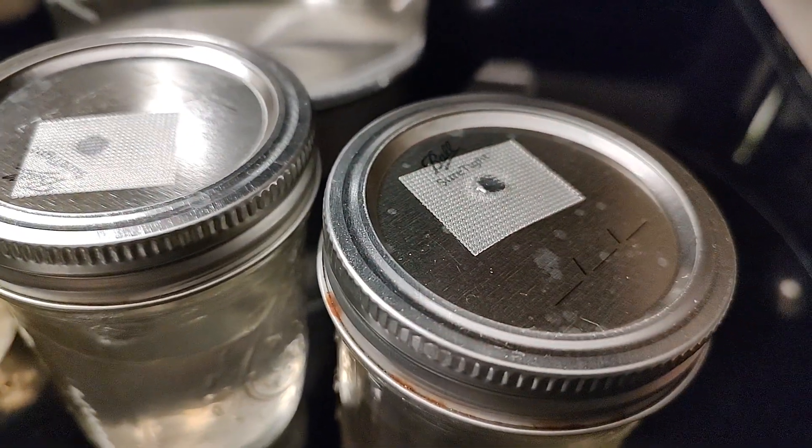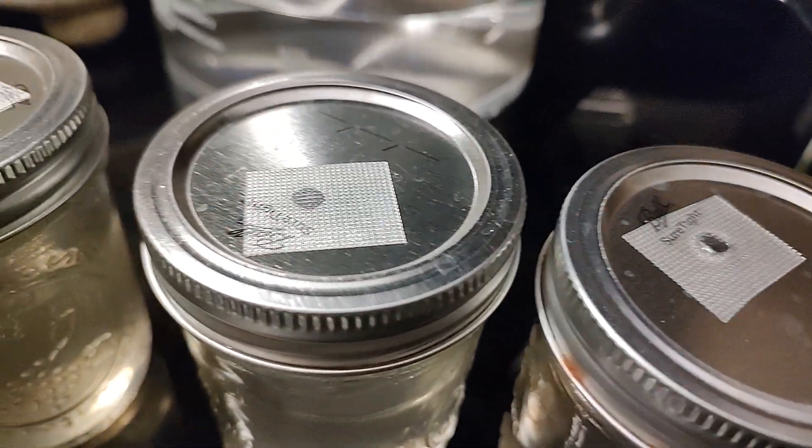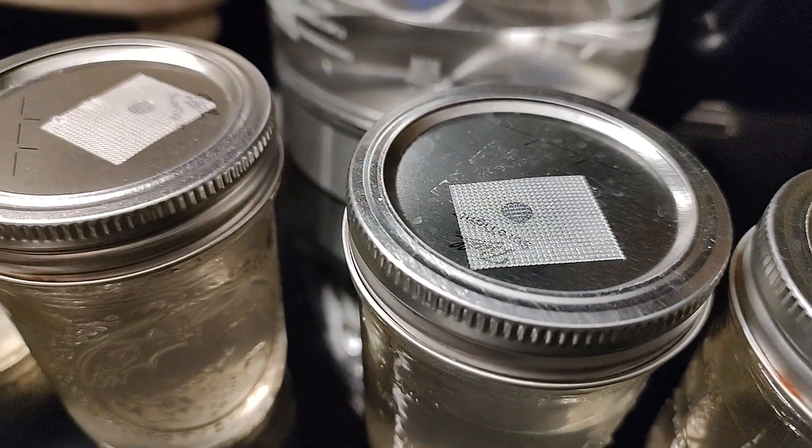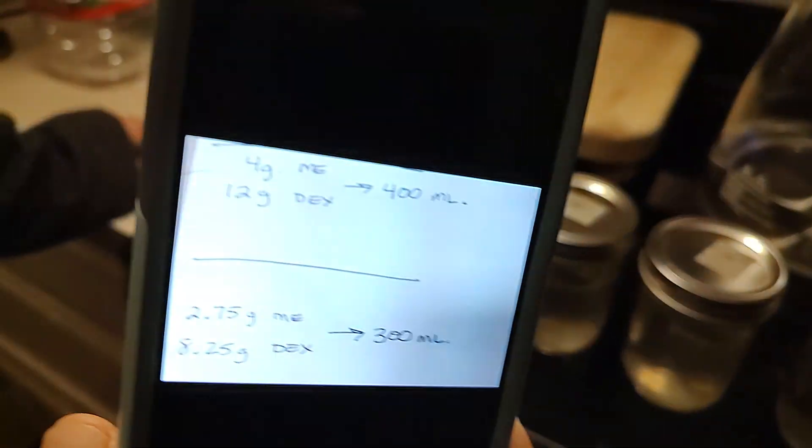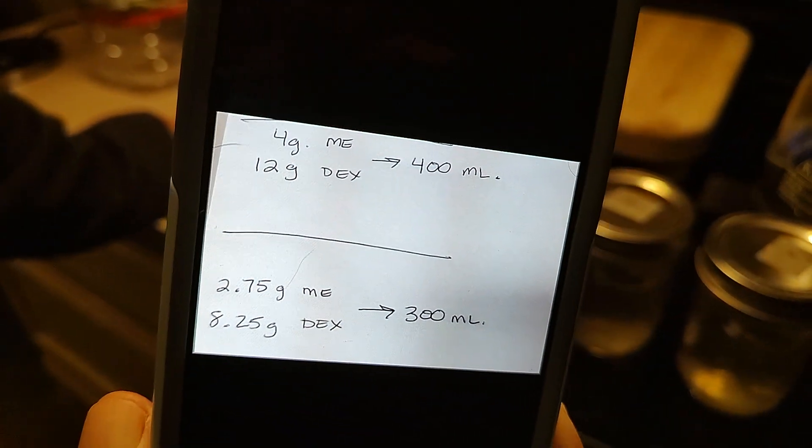We do not have syringe ports, but we do have breathable tape here for oxygen and air exchange. We don't think syringe ports are necessary, and we have a video on that if you want to check that out.